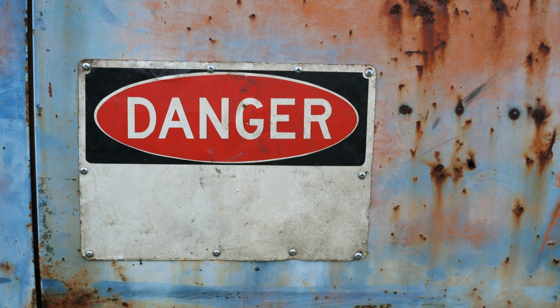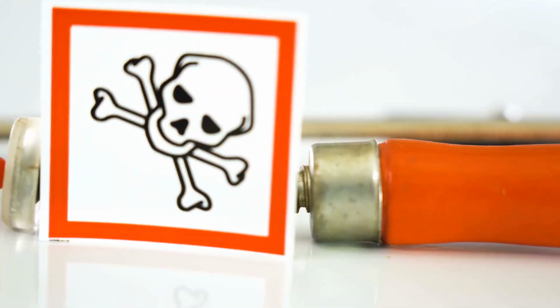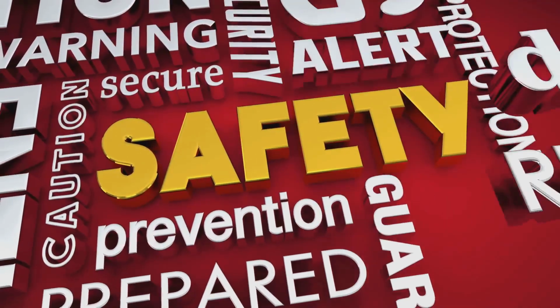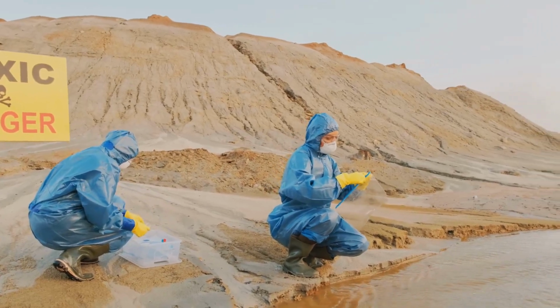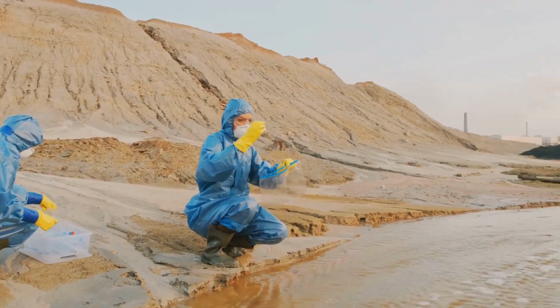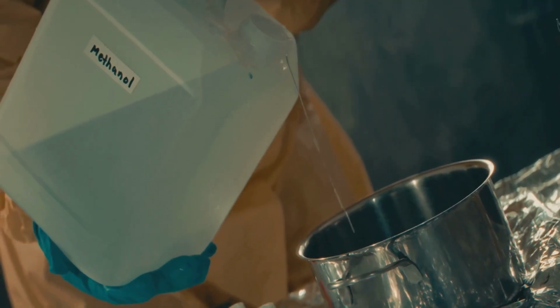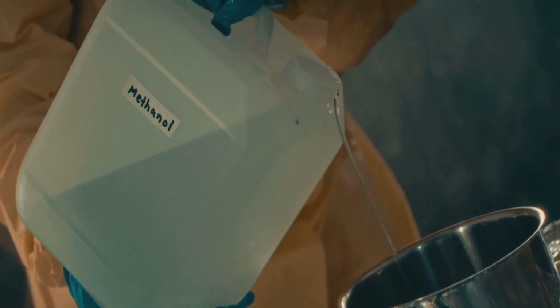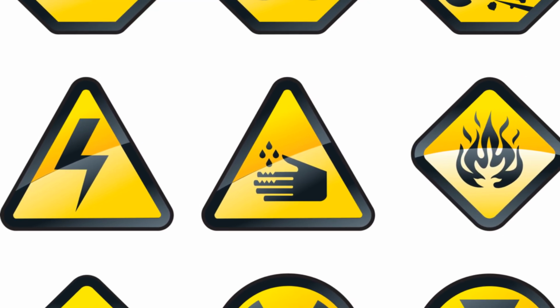So there you have it. The big three primary hazards. Flammability, the risk of fire. Toxicity, the risk of poisoning. And reactivity, the risk of a dangerous chemical reaction. Each of these dangers is significant and requires your full attention whenever you are handling a solvent. Understanding these risks is the first and most critical step in using these chemicals safely. It's like learning the rules of the road before you start driving a car. Knowing what can go wrong helps you make sure everything goes right. These aren't just abstract concepts. They are real-world dangers we must prepare for.